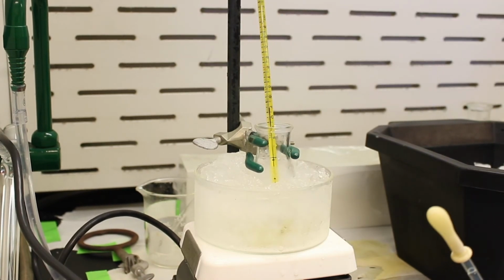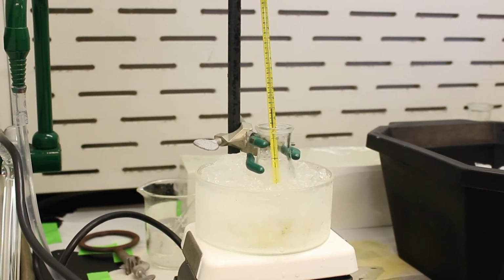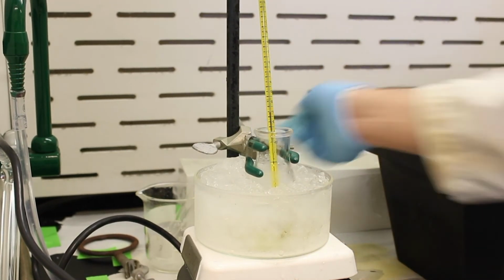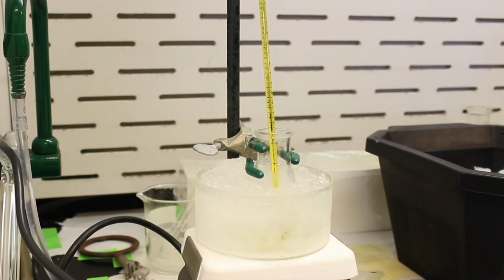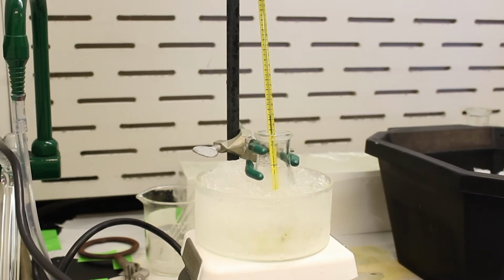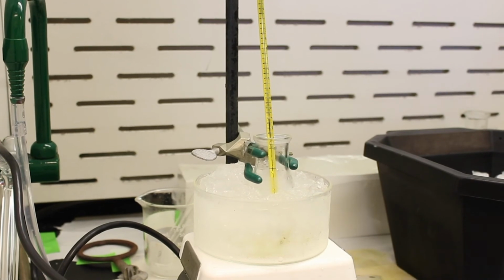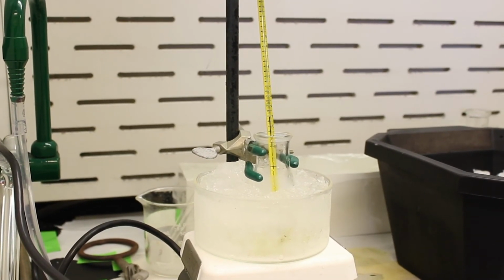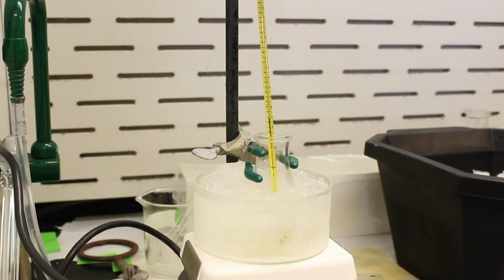Okay, so now that all the nitration mixture has been added, we're going to let this mixture stir for about 15 minutes. And then we're going to precipitate the product from it. Right now everything's soluble in sulfuric acid. So we'll mix it with some water, precipitate the product, which is a solid, and then isolate it, dry it, and then get a mass.